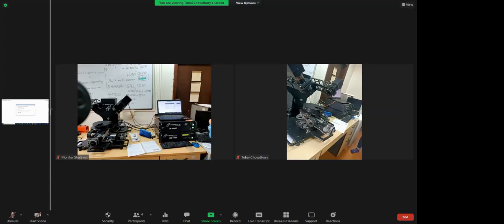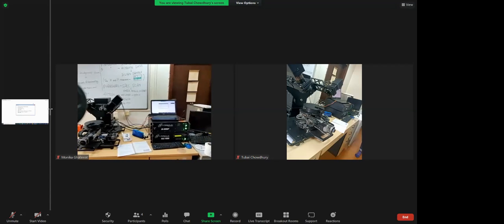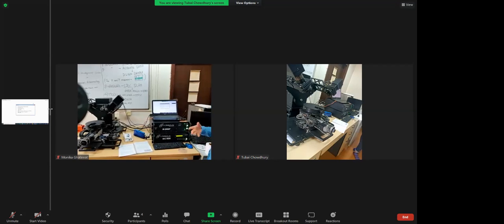And then you have to open your generate data window by going to Window, and there will be one window, generate data, and then right click and go for generate data. It will generate the data for whatever model you have provided, and after that you have to go to the fit window. There you have to go for normal fit. Generally we go for normal fit. You can go with other fits also. After that you will see that all the parameters are there in your fit window.